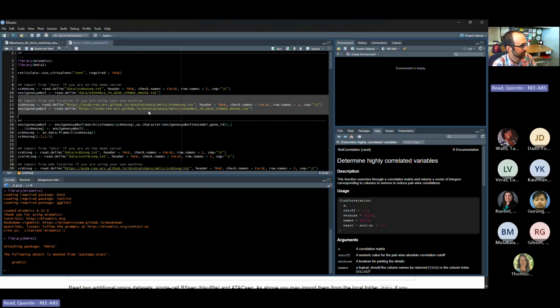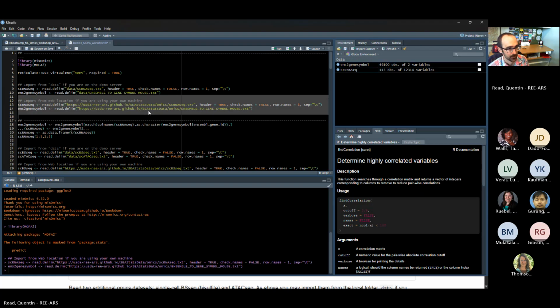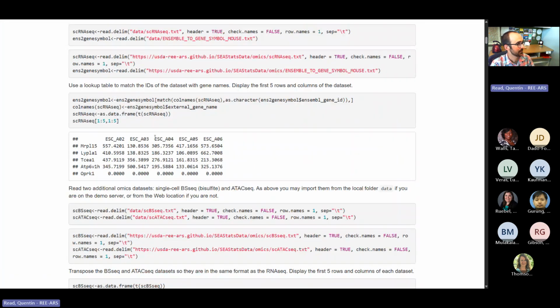So go ahead and run those 2 lines there. So that should take a second to download those and import them. Okay. Going back to the lesson.